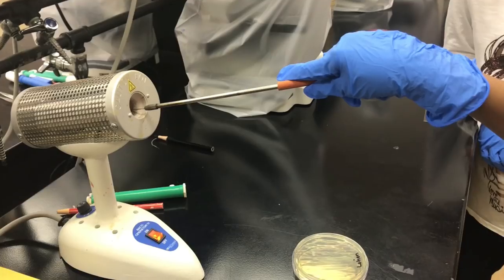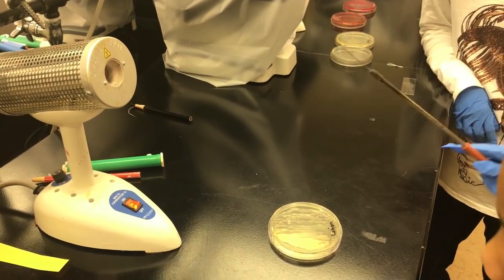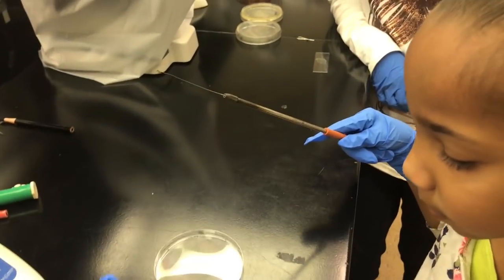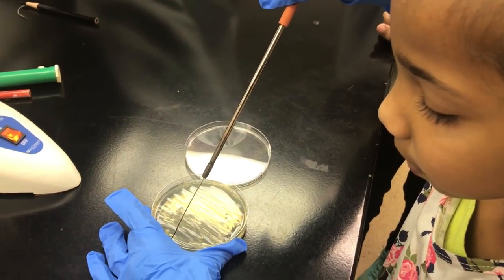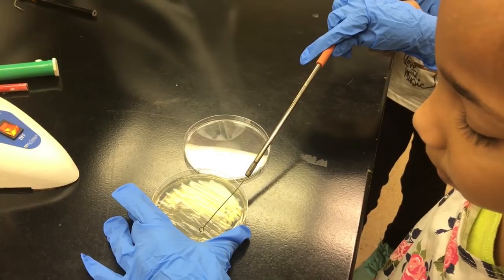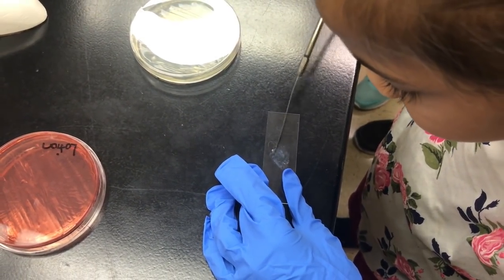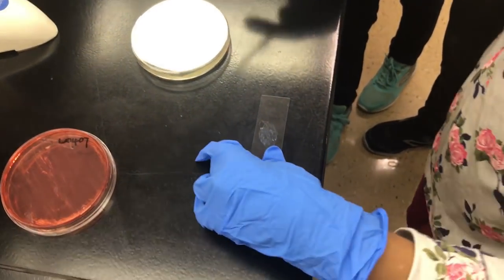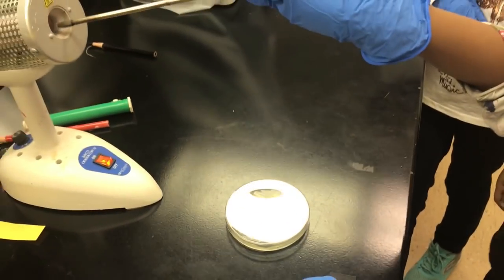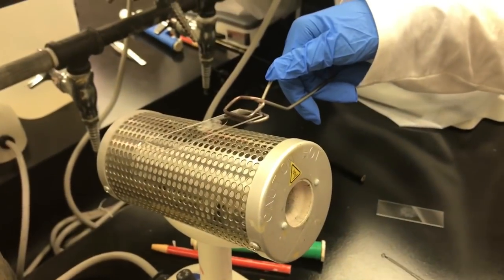Take it in. Get the sizzling until it stops. You take one of the colonies. A lot of bacteria you've picked up now. Okay, heat up the loop. You don't have gloves on, so don't expect to do anything. Put it on here. It's facing this way. No, like that. I'll tell you when to stop.